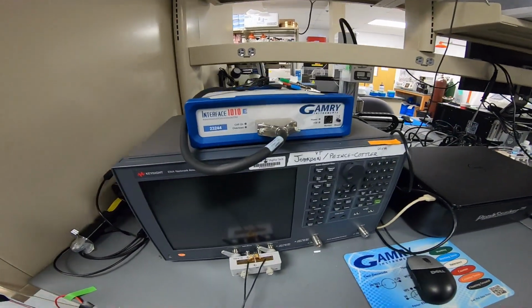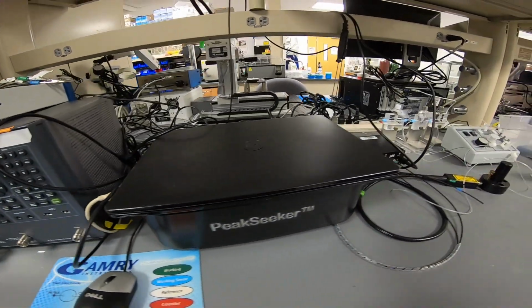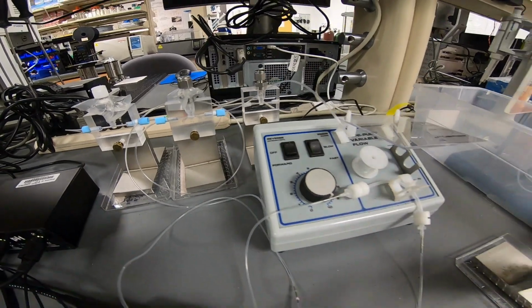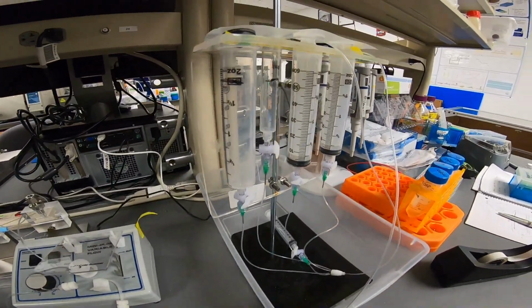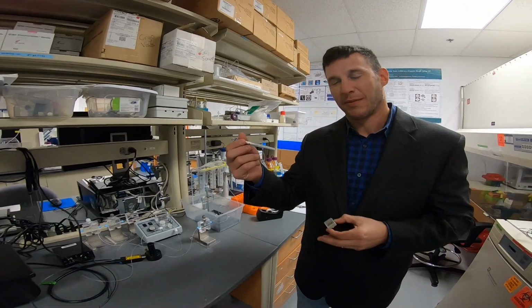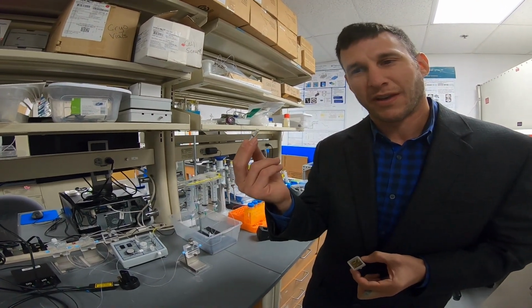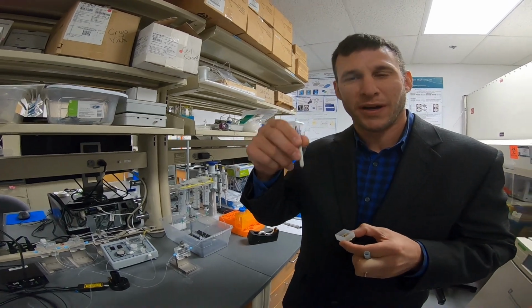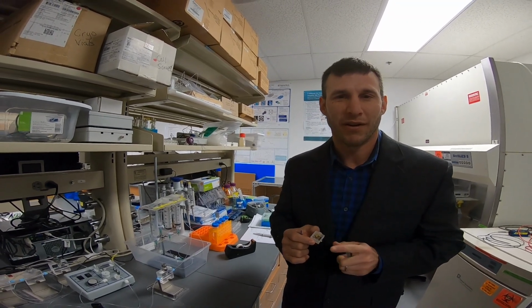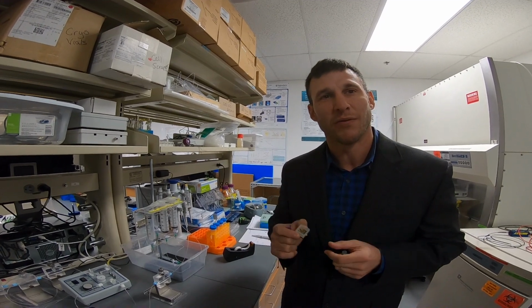So as I mentioned before, in the biomanufacturing and biosensing lab, we're very invested in creating next generation process analytical technology that can be leveraged in biomanufacturing processes and also in other applications that require the ability to detect molecules with high precision, high accuracy. Some of the main workhorses of our laboratory are in the form of cantilever sensing technology, which is a type of technology you can see here that has a dipstick type format. So we're able to develop sensors that can be used as probes and can be interfaced with robots to do automated measurement applications. Another application that we're very much interested in is creating sensors and sensing technology that can do high throughput measurement.